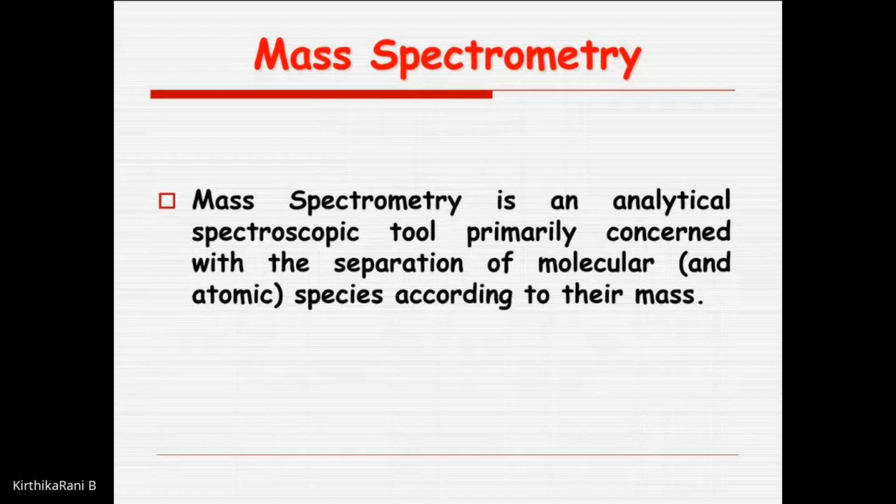So generally, what is mass spectrometry? Could anyone tell me what is the role of mass spectrometry? To determine the molecular mass. Yeah. So the basic major function of mass spectrometry is to determine the molecular weight, the molecular mass of the compound. What else? What else you get to know from mass spectrometric data? Some fragmentation peaks. Yeah, so from the fragmentation peaks, you can get some structural details. Mass spectrometry is very important to know structural details.